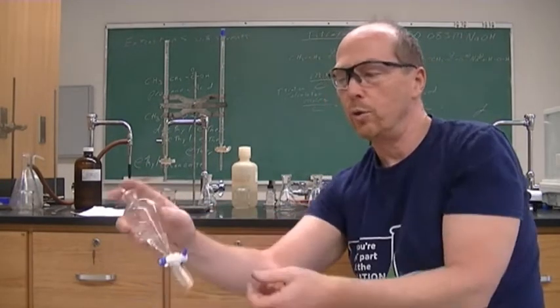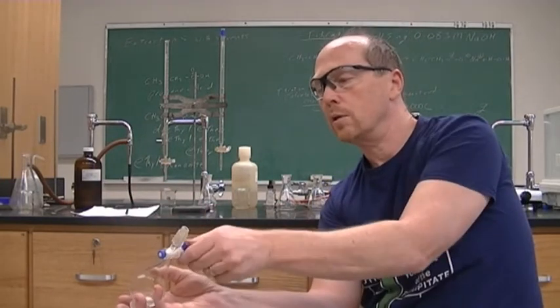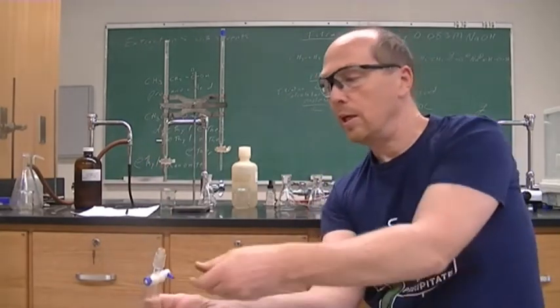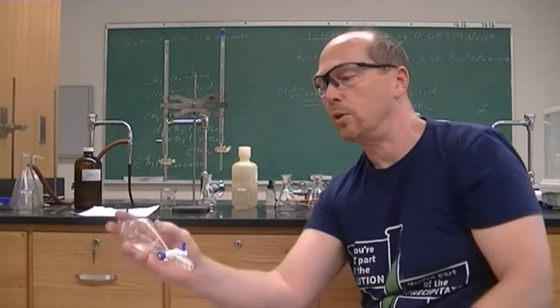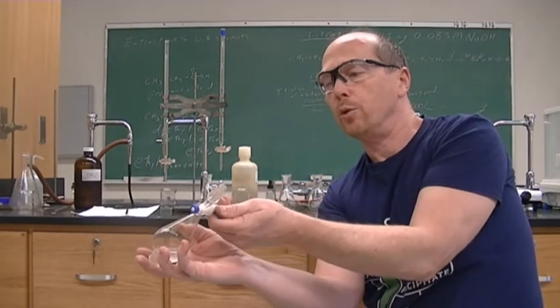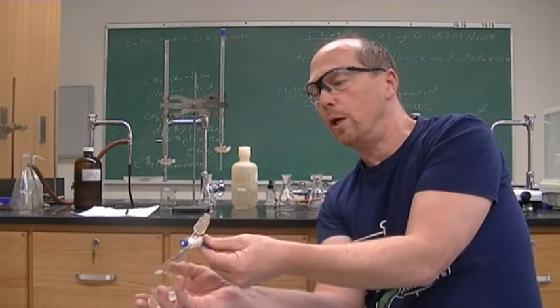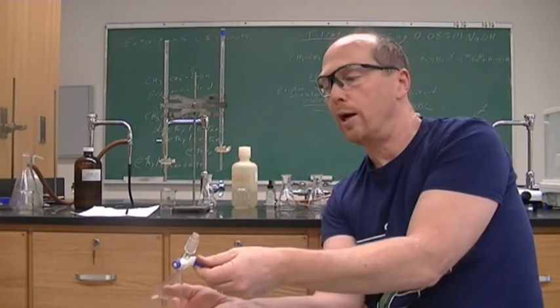When you can't hear it at all when you are venting, now you can mix it up, and when you turn it up, you have zero vapors coming out. It has reached its equilibrium. If you did this to start with, the pressure would build up so much that the top would be popped right off.